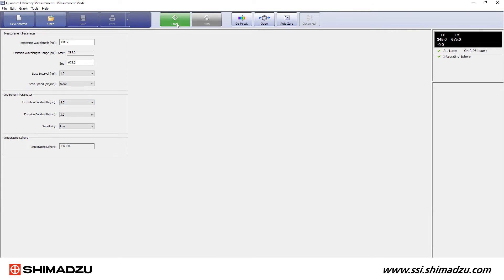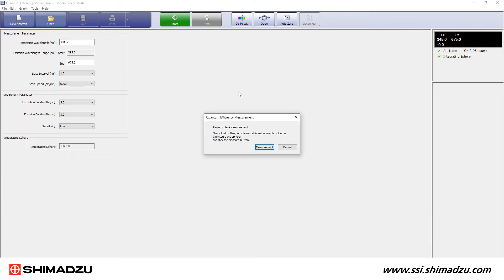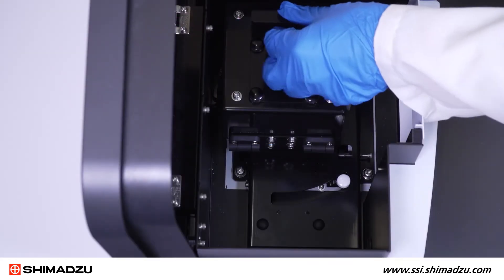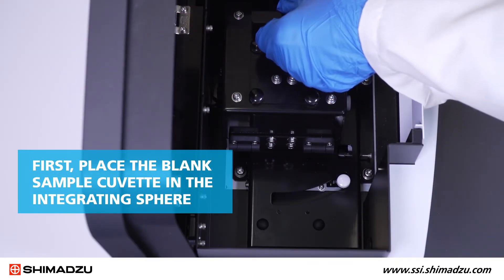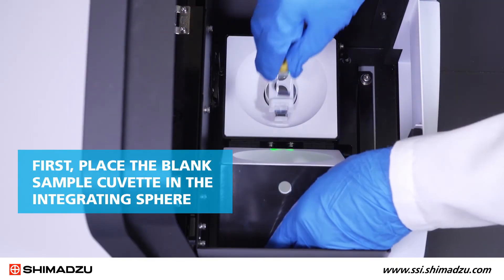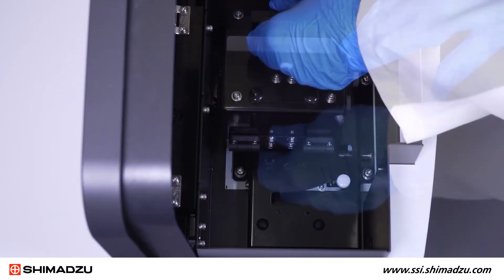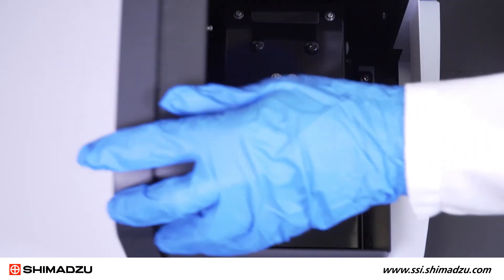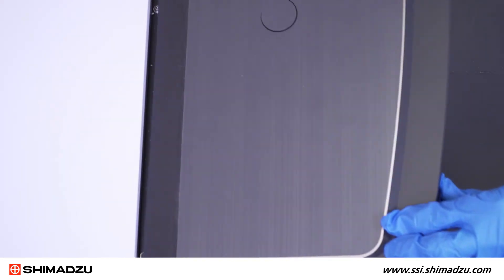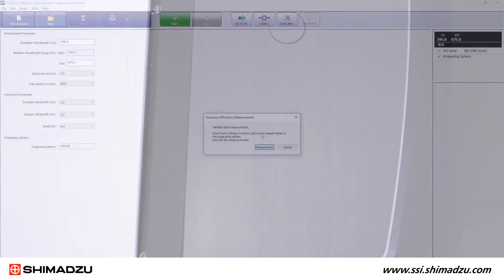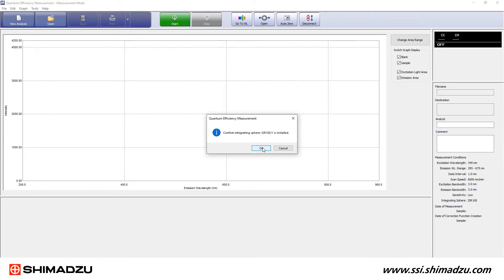Click Start. Follow the on-screen prompt to measure the blank sample. First, place the blank sample cuvette in the integrating sphere. Then click Measure. You may be asked to confirm that the integrating sphere is installed.